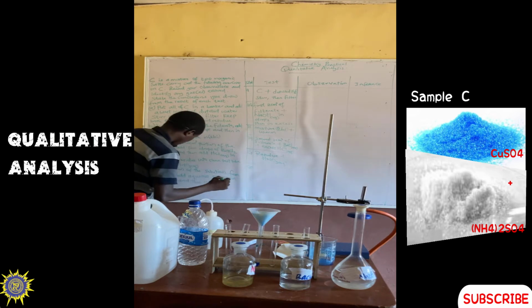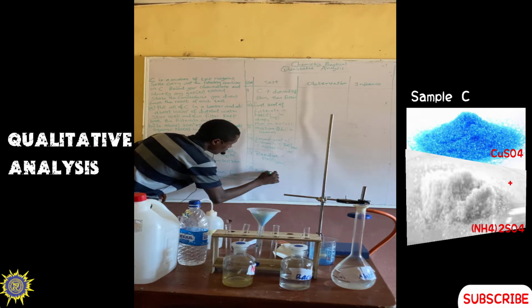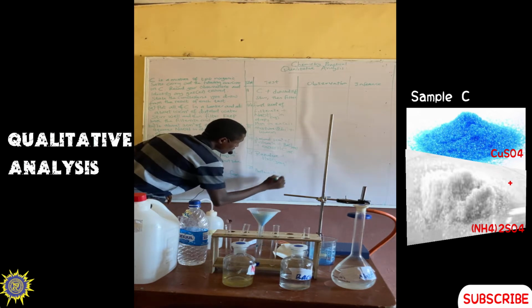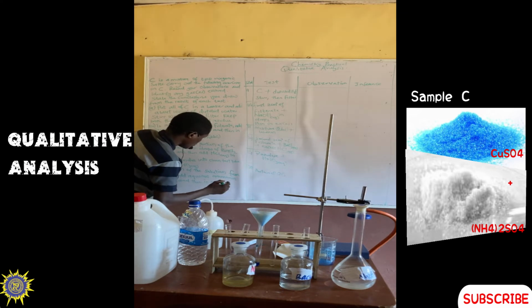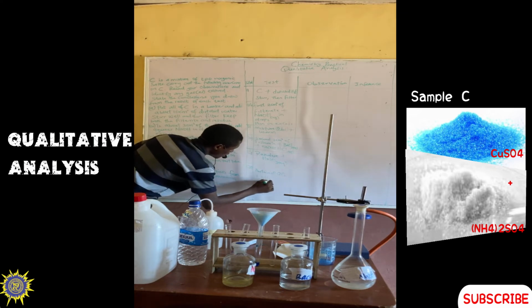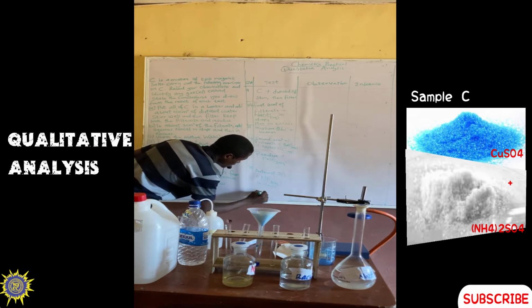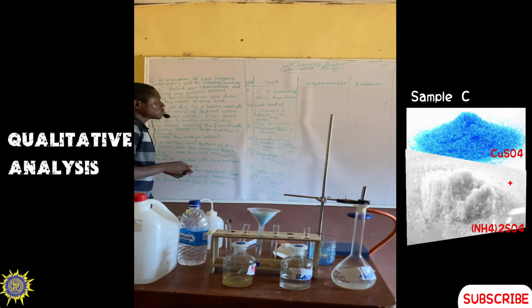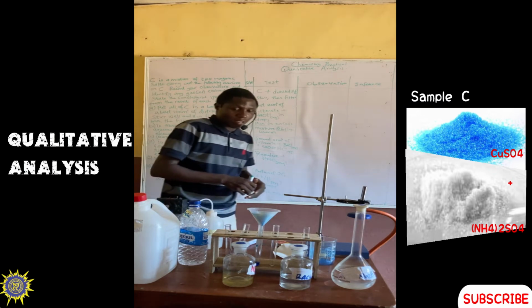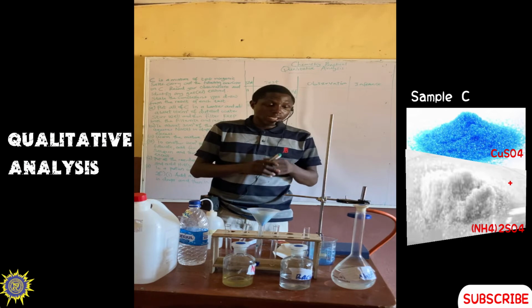We have a portion of 2C Roman figure 1 plus aqueous ammonia in drops, then in excess. So this is what we have to carry out in the experiment, and the questions we have to answer in the table.